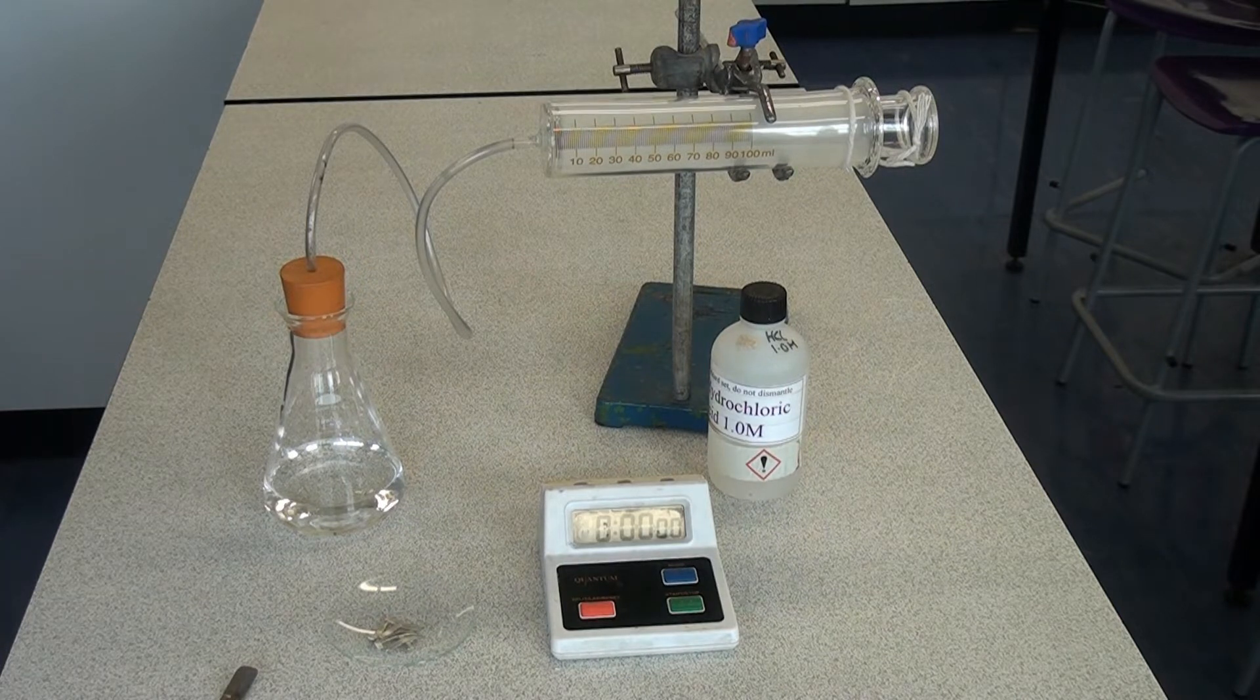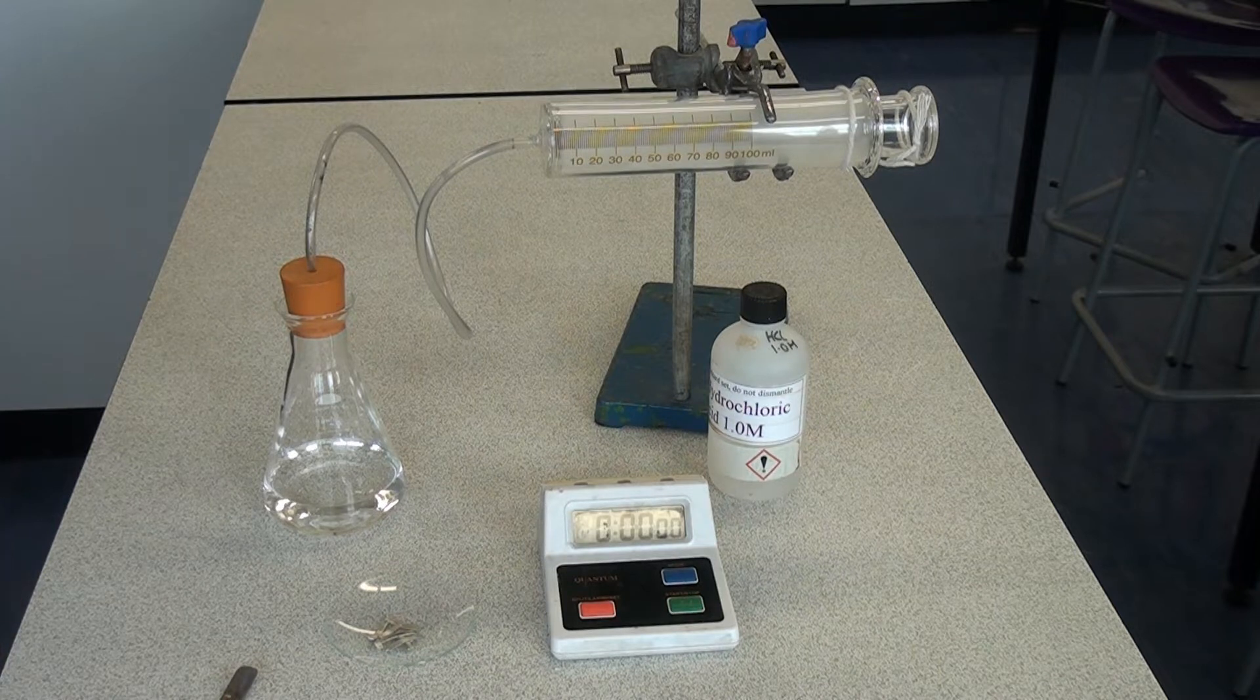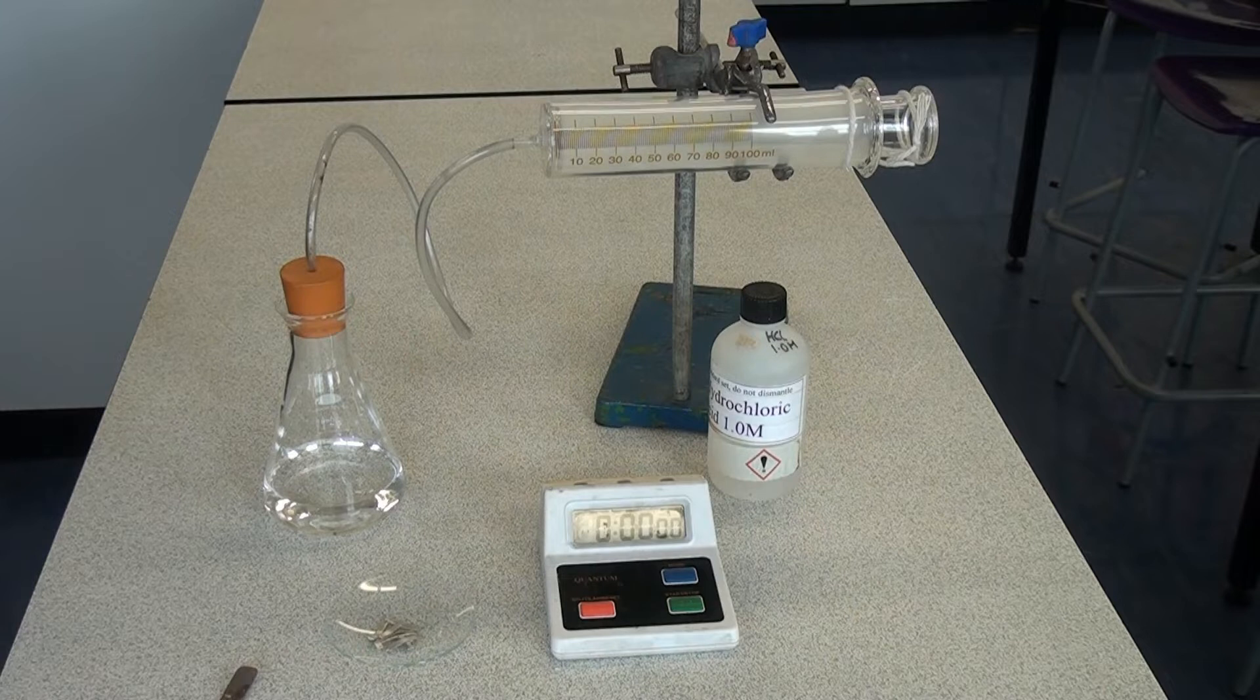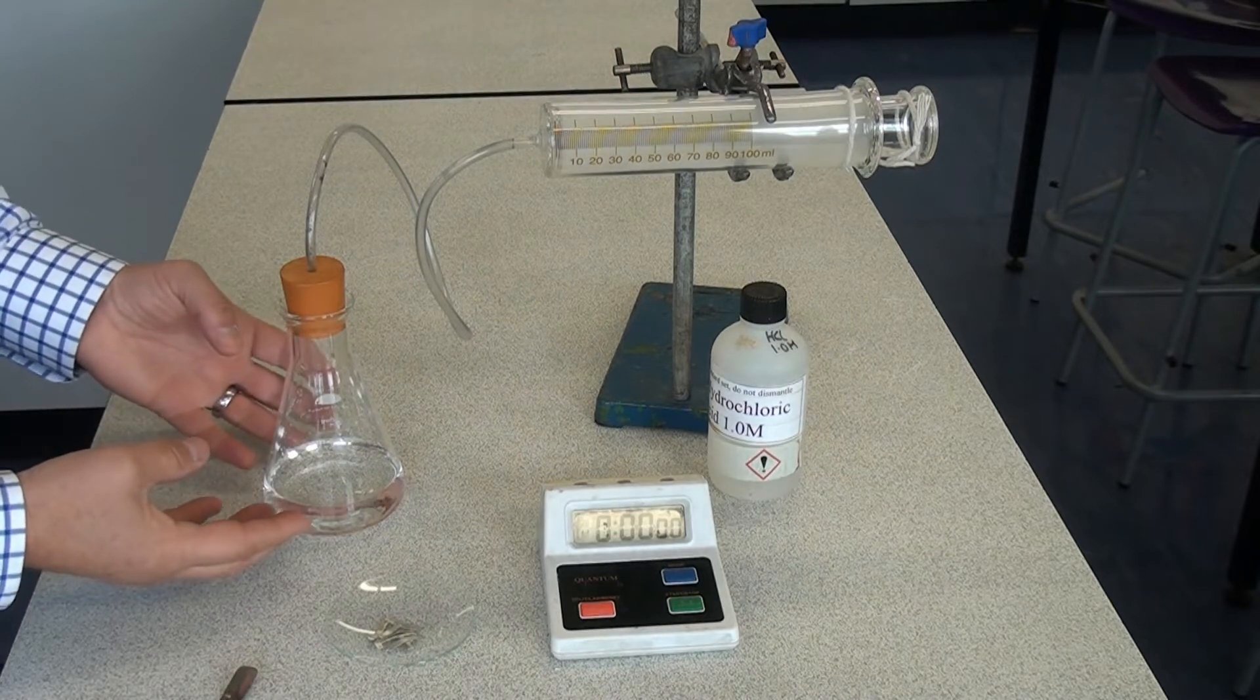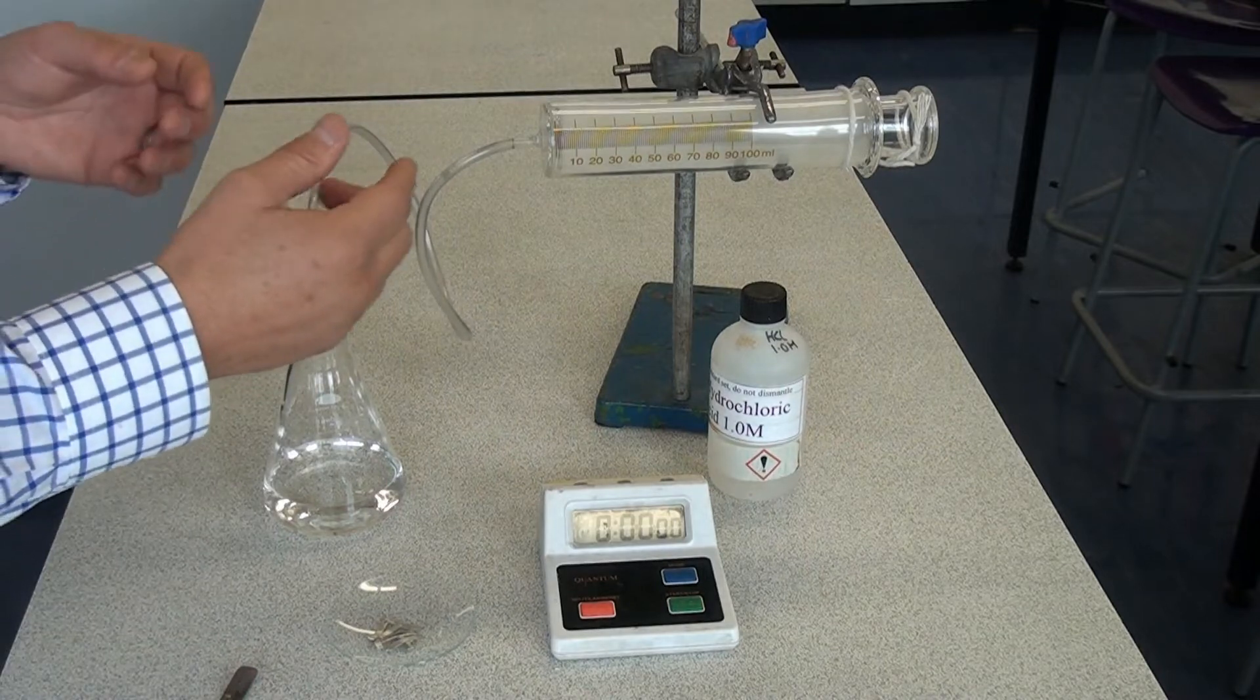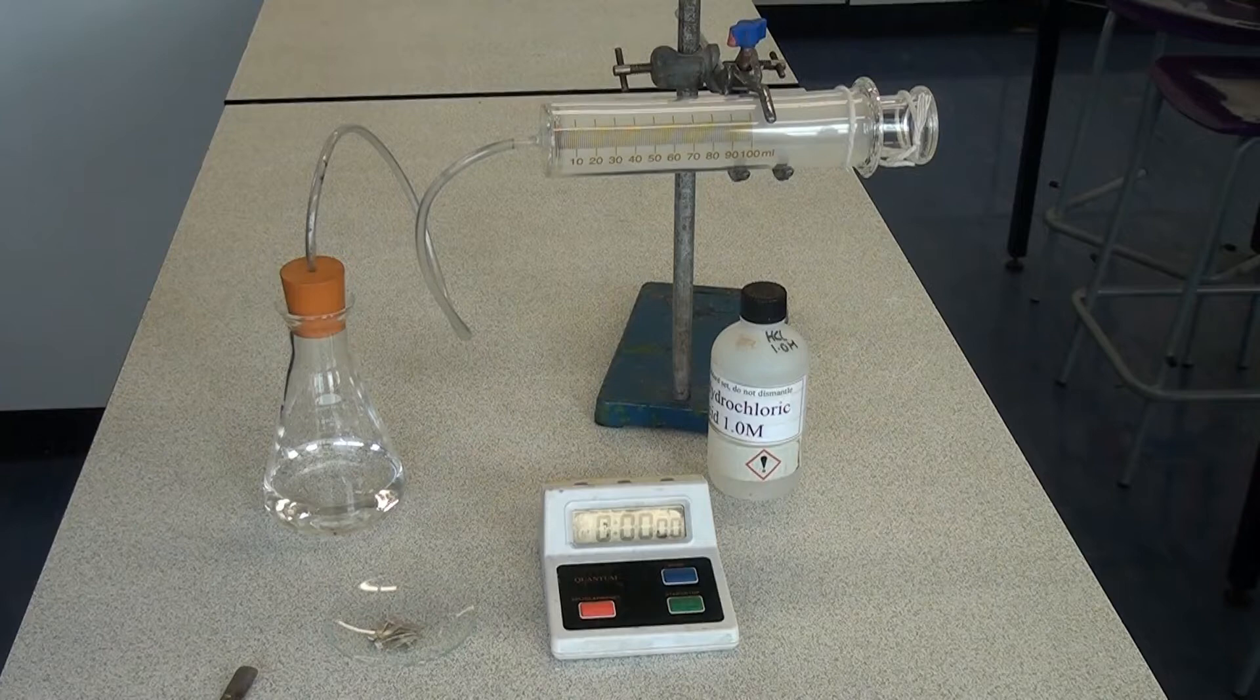So once we know that the chemical reaction is going to produce a gas, there are a number of ways we can collect that gas to measure the rate of reaction. The first method is using a gas syringe, which will be used to collect the gas. As the reaction bubbles, the gas will be made, it will pass along this delivery tube and then we'll see the gas syringe moving out and we can read off the volume of gas made.